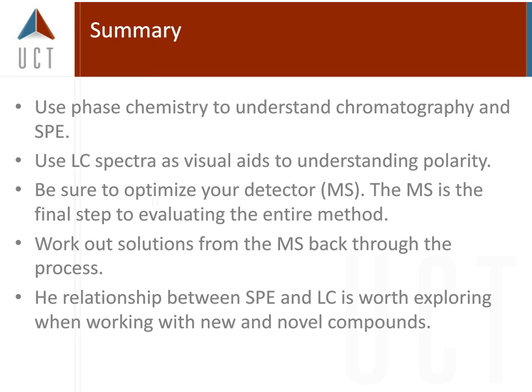So finally, in closing, I tried to use the same properties of solid phase extraction and liquid chromatography, the phases. The chemistry is the same. How do I use those applications to help develop and understand where my solid phase extraction can be enhanced or where I may be running into problems? The LC can be used as a visual aid.